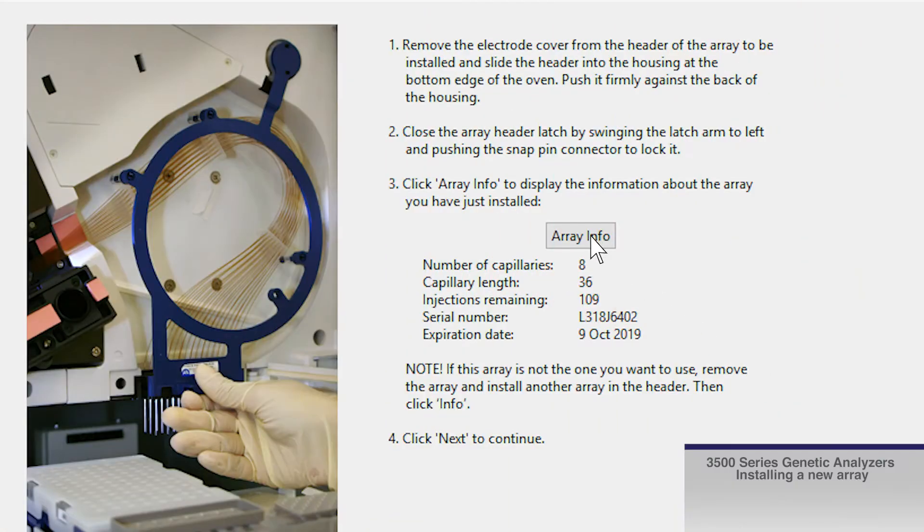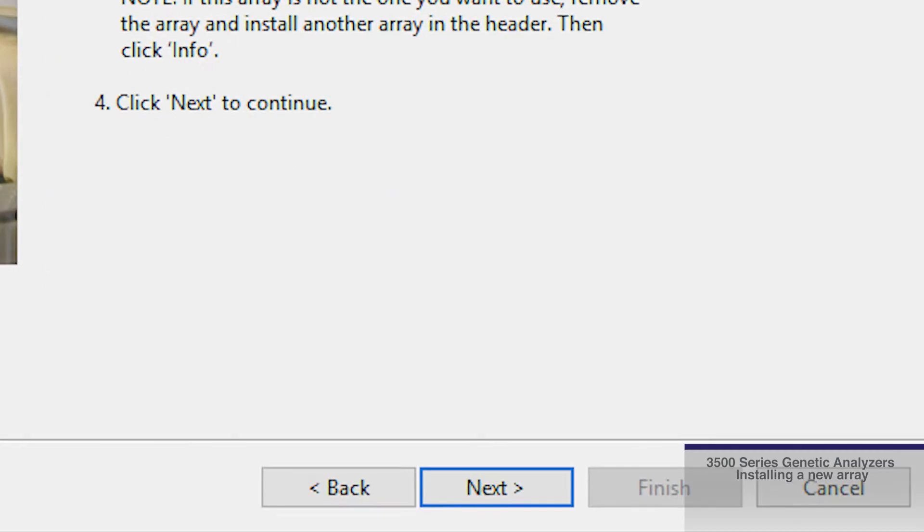Click Array Info in the wizard to verify array information. After verifying array information, click Next in the software.